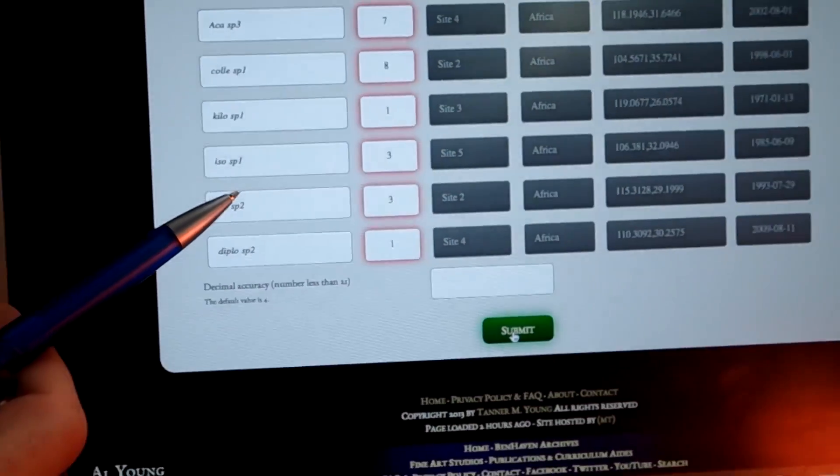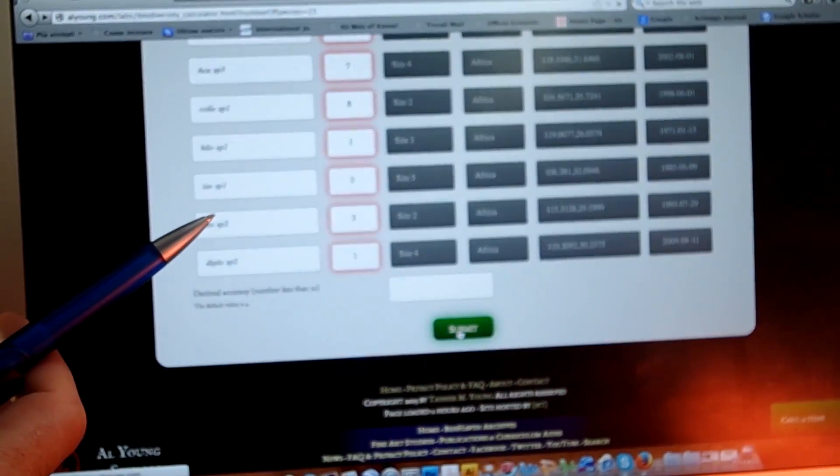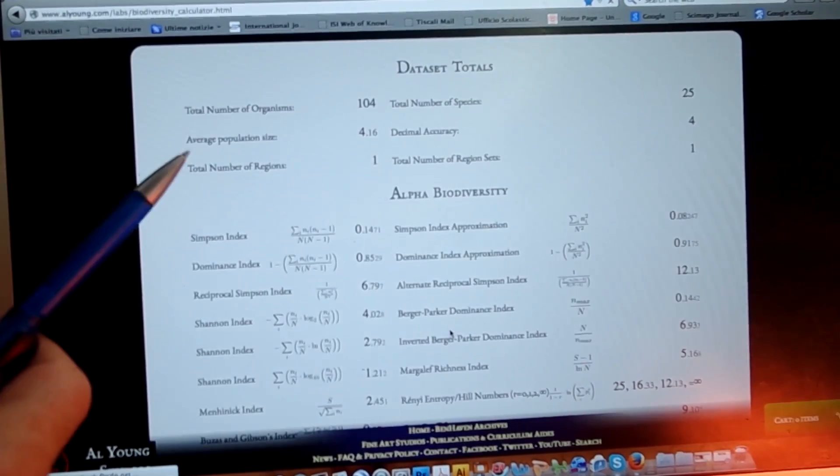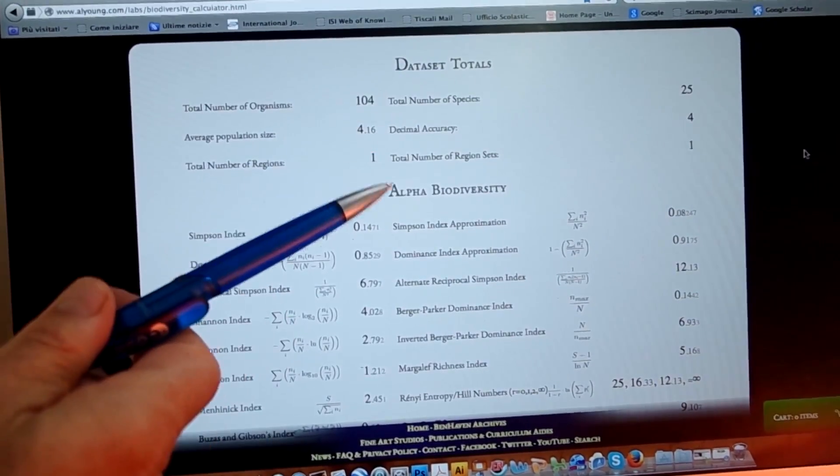You will see there is a button that says 'Submit.' When you click it, the website will start all sorts of calculations. Don't get scared when you see the next page, because you'll get a page with a lot of formulas — a lot of things that are interesting for scientists like Paolo.